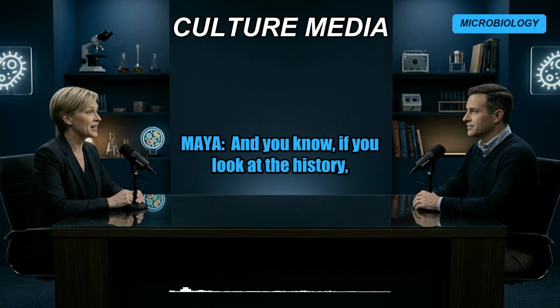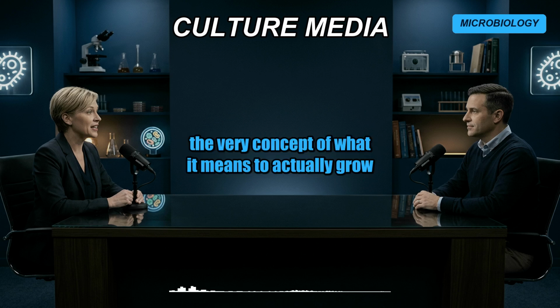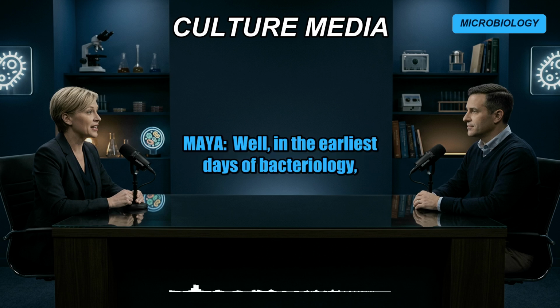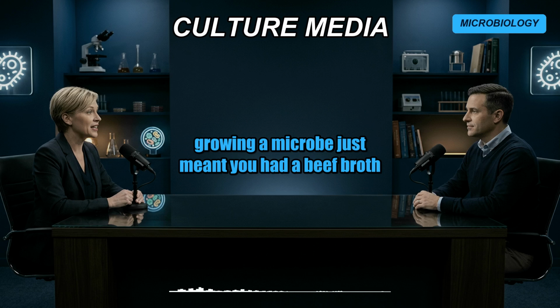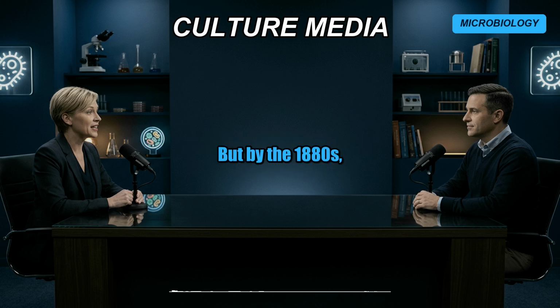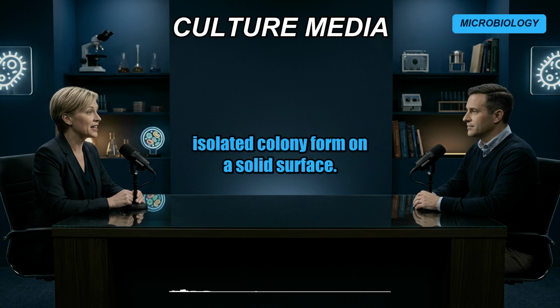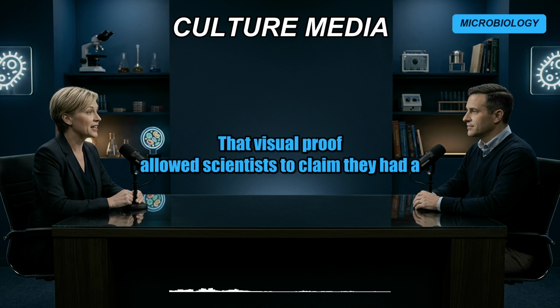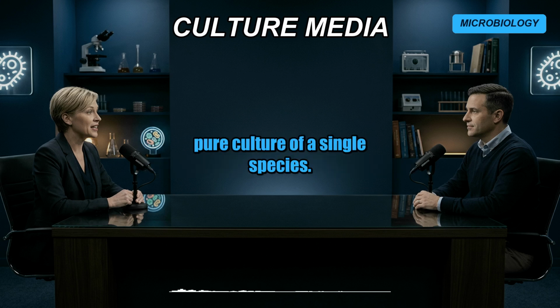And if you look at the history, the very concept of what it means to actually grow a microbe has quietly shifted over the last 150 years or so. Really? How so? Well, in the earliest days of bacteriology, growing a microbe just meant you had a beef broth that eventually turned cloudy. Just cloudy water. Right, cloudiness equaled life. But by the 1880s, the standard became much stricter. It meant watching a visible, isolated colony form on a solid surface. Ah, so you could actually see a little dot of bacteria. Exactly. That visual proof allowed scientists to claim they had a pure culture of a single species.